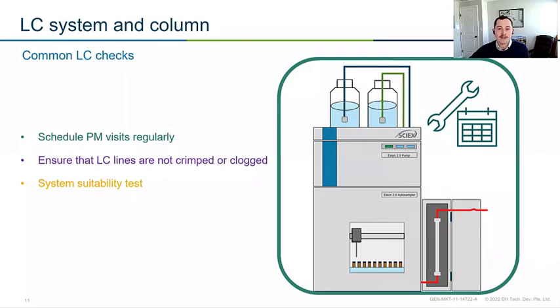These instruments are operating at high pressures. They're moving constantly. We have pistons, we have rotors, we have a lot of moving parts that just get worn up over time and need to be replaced. It's an easy thing to overlook, but it's a really important thing to keep in the back of your mind and to schedule for. In my opinion, doing it once a year is pretty easy to schedule for because you just do it at the same time you do your mass spec PM.